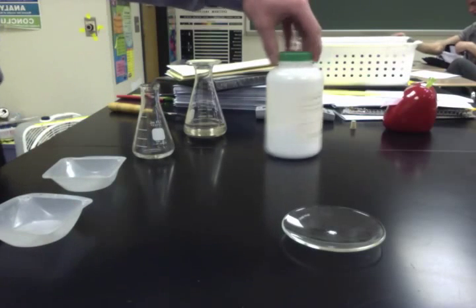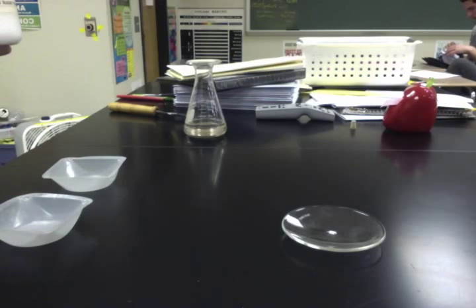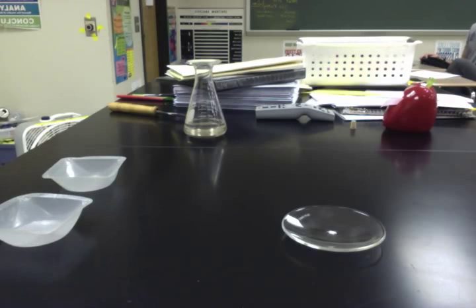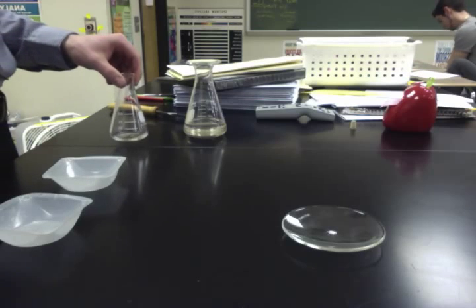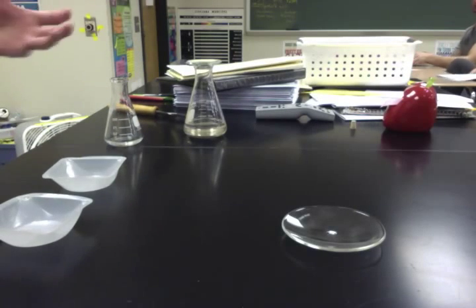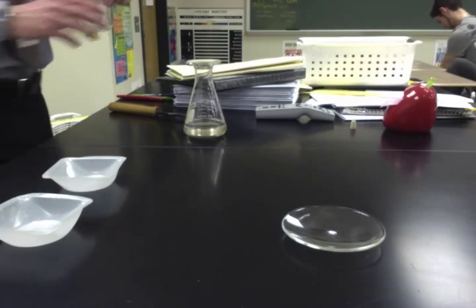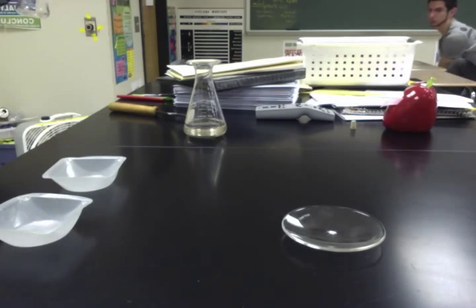Out of sodium acetate and water. Okay. So in this case, my solvent is water, and oftentimes water is the solvent. My solute is sodium acetate. Okay. So when you mix two things together, you can make a saturated solution if you put as much of the solute as possible into the solvent.